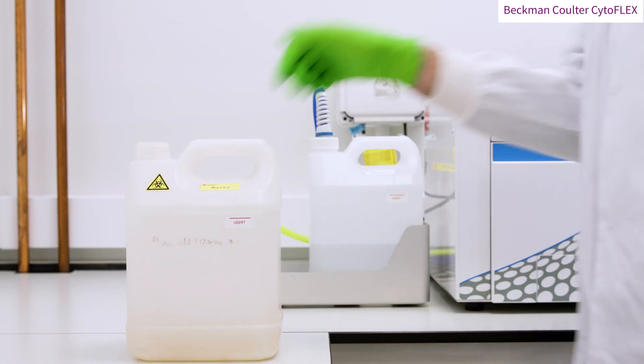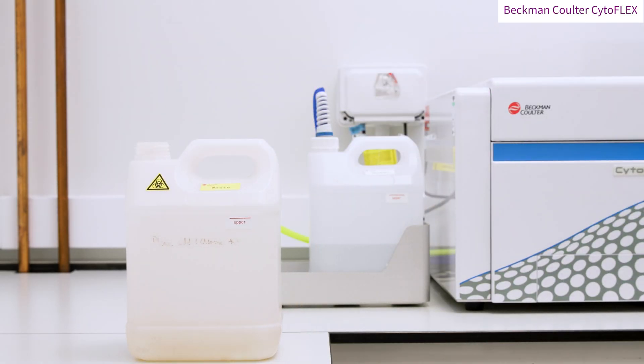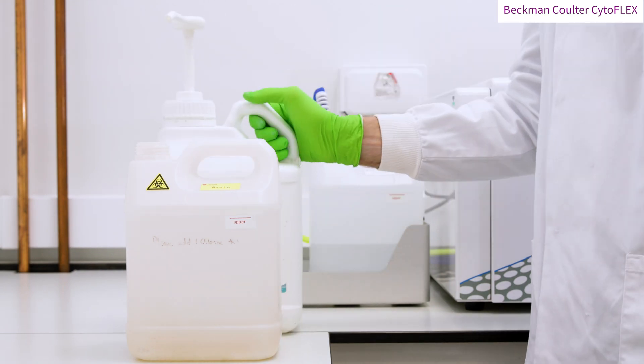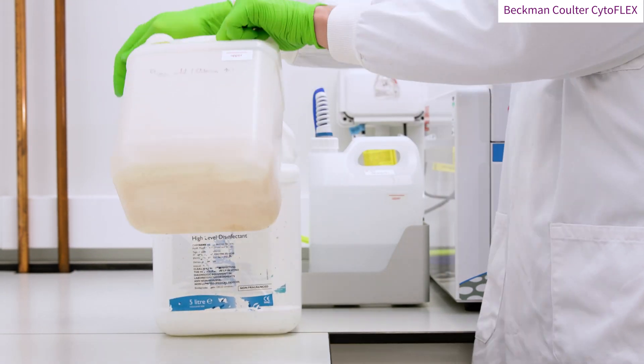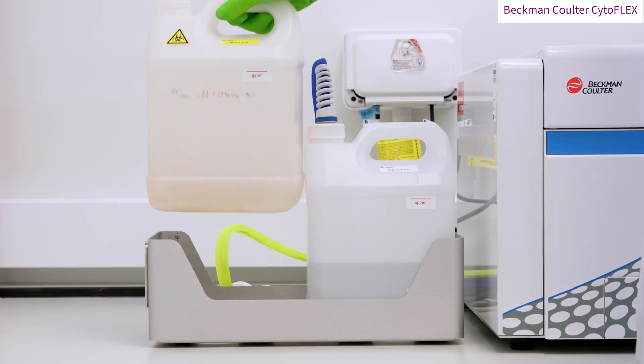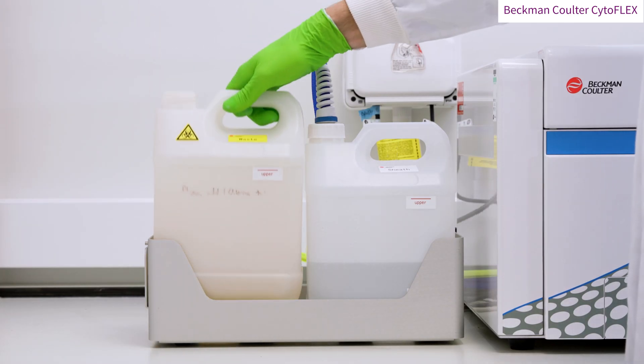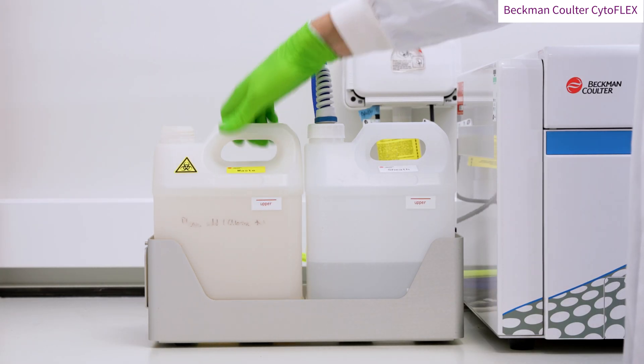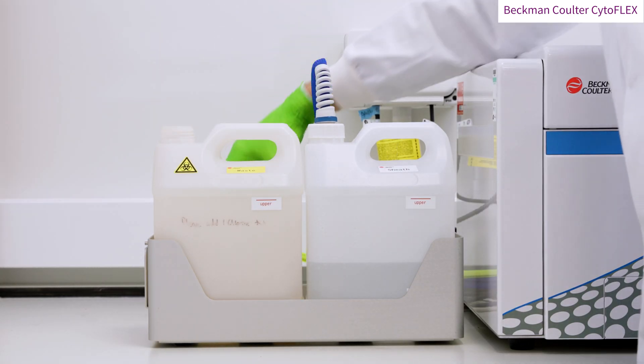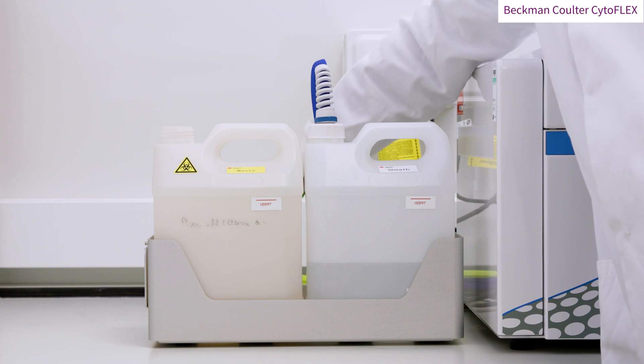You may wish to add a decontamination reagent to the empty tank, such as bleach. Finally, screw the lid back on.